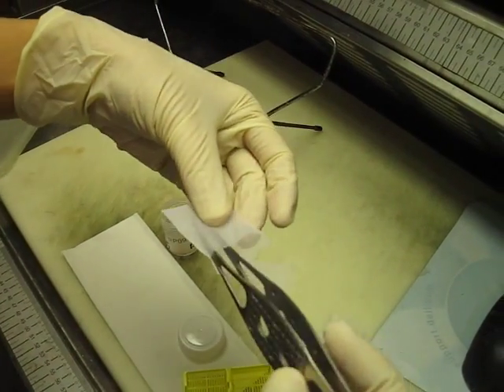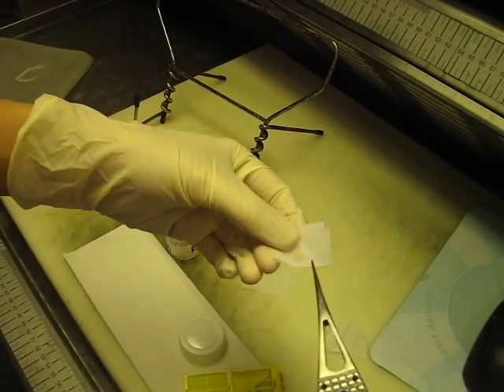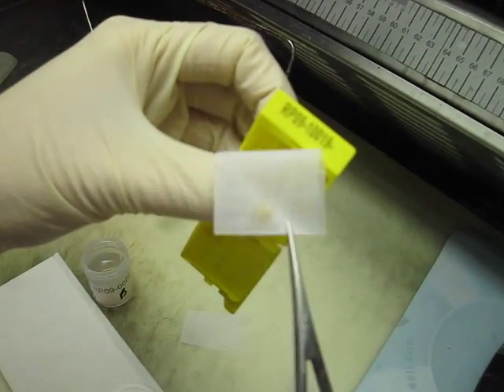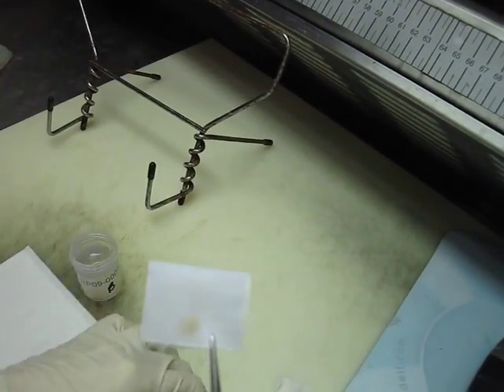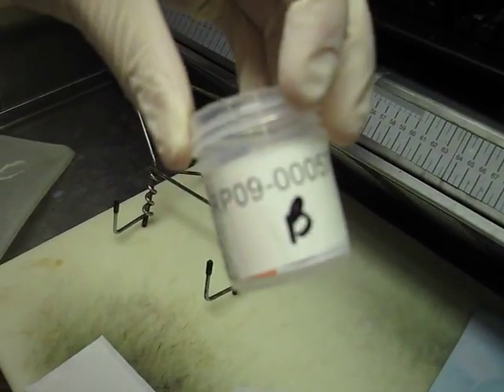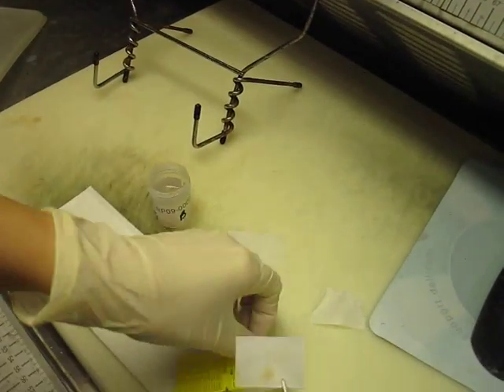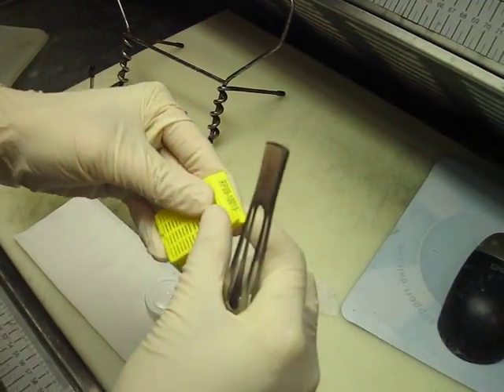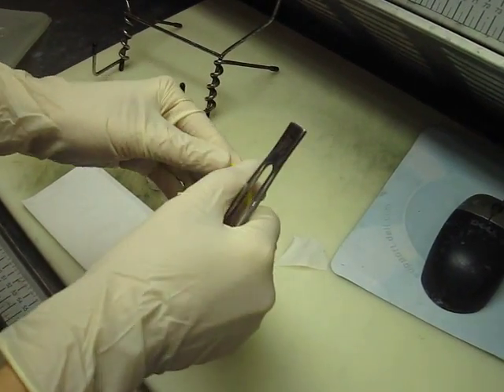So we put it in the bag and put it in one of these pre-printed cassettes, and the accession number on this has to match the accession number that was given to us initially. So this identifies the specimen for the particular patient. After we put it in, backtrack a little bit.